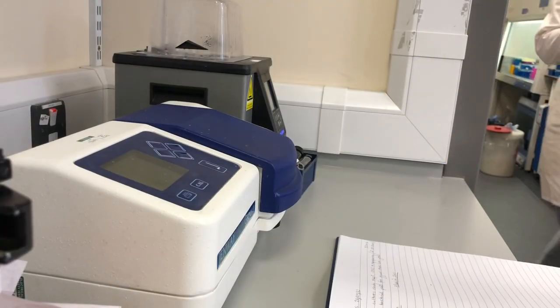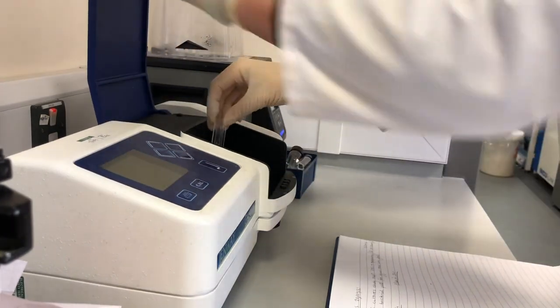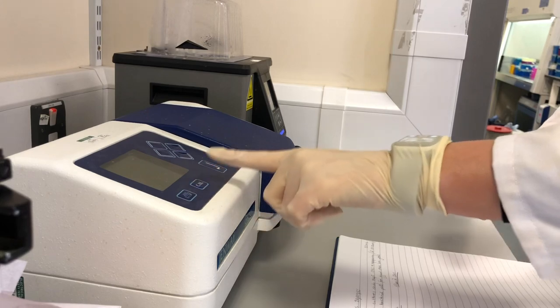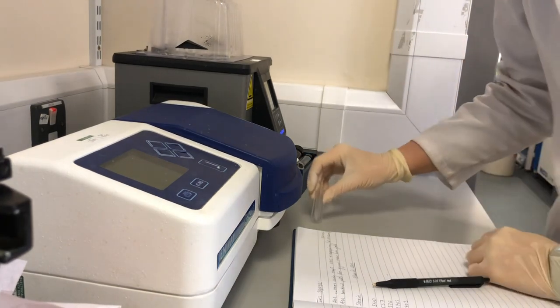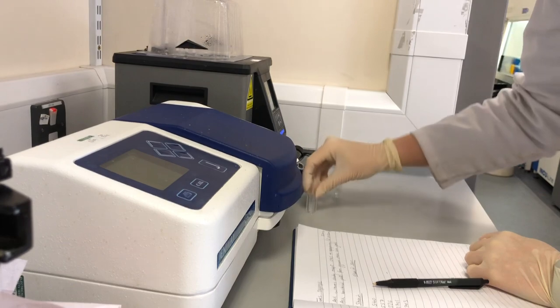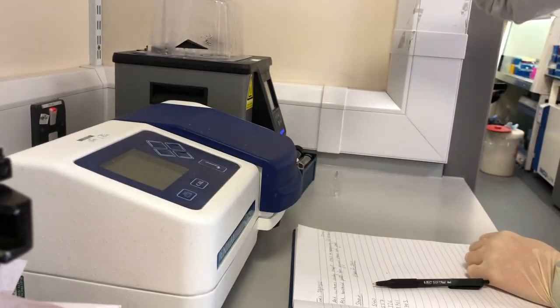One of the main experiments I've been working on recently is tracking the growth of my bacteria over several days, so that's what I'm doing here. I'm first of all calibrating the instrument using something we call a blank, which basically is the media that the bacteria grow in without the bacteria in it. And then I use that as a background to compare my bacterial samples to.